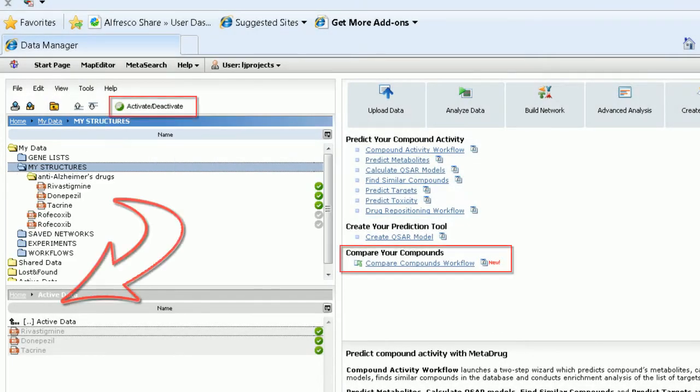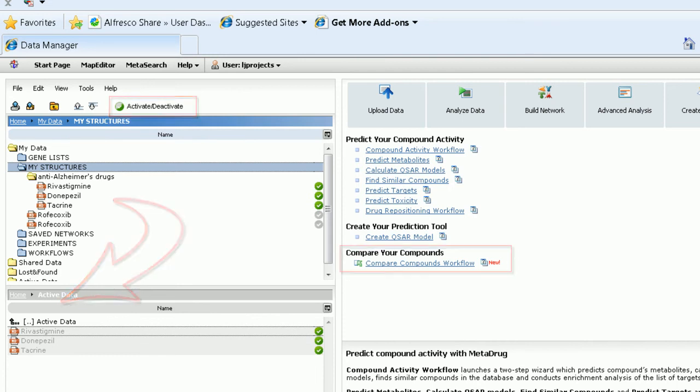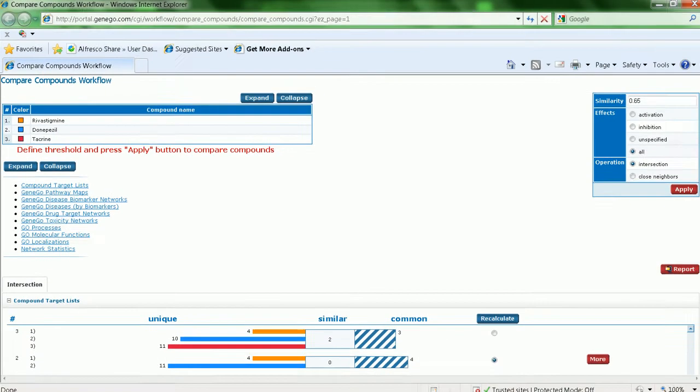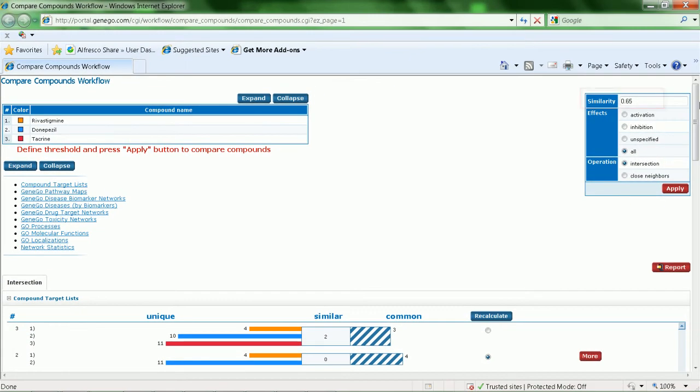Next, activate the reports and launch the Compare Compounds workflow. At this step, first specify intersection settings, hit the Apply button, then select the desired intersection.